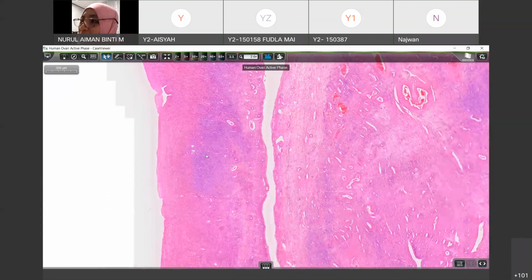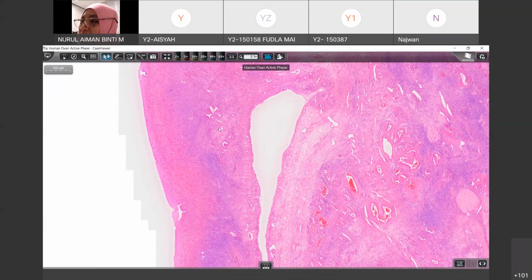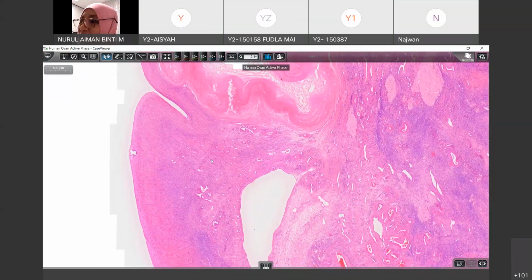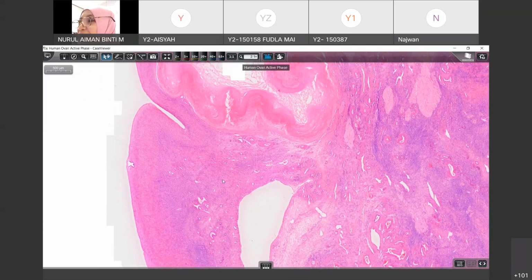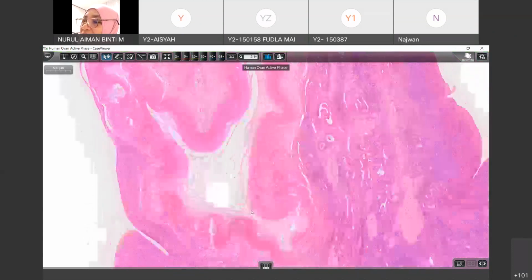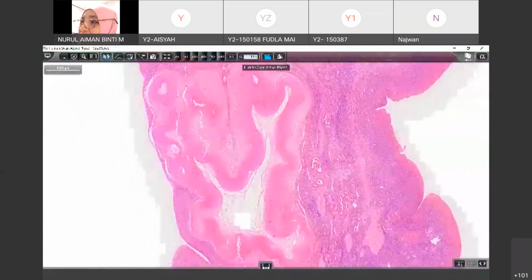In this slide, as I mentioned in my lecture, the ovary will not produce a lot of mature follicles because it will ovulate, everything will be ovulated. So at one time, usually only one will develop. In this ovary, you can find this one, which is very large. What is this that I just mentioned to you?